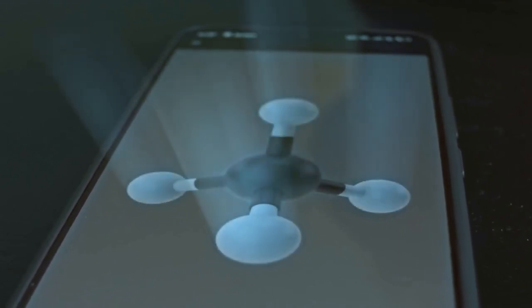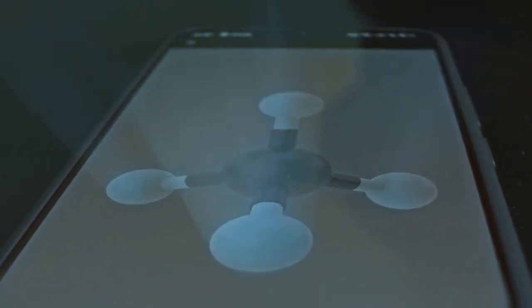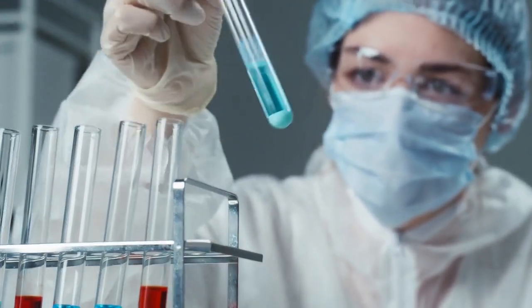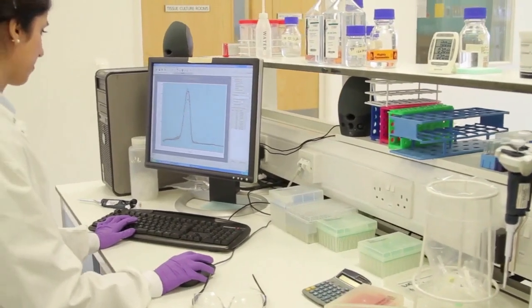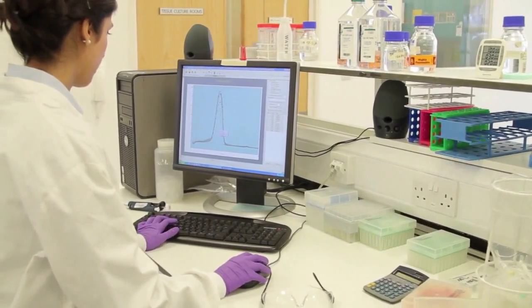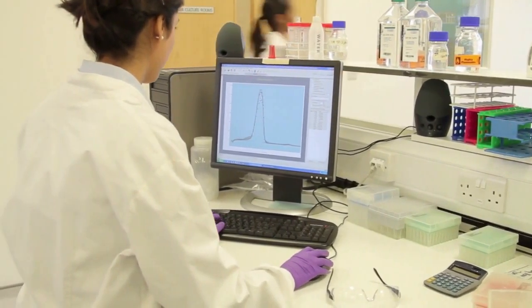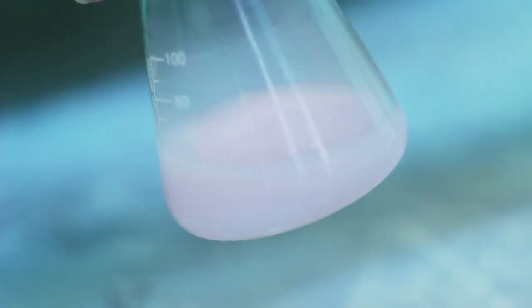To get a more meaningful value, we calculate the adjusted retention time, or T_R prime. This tells us the actual amount of time the analyte was retained by the stationary phase. The calculation is very straightforward. You subtract the dead time from the total retention time. So, the formula is T_R prime equals T_R minus T_M. This value is critical because it isolates the chemical interaction from the simple travel time.